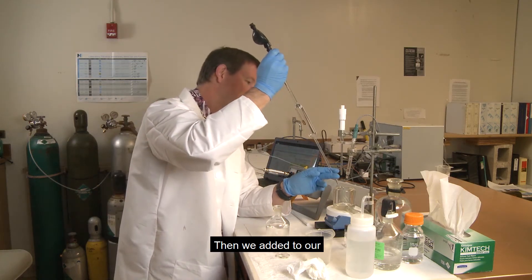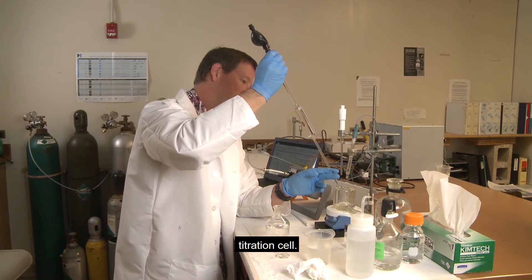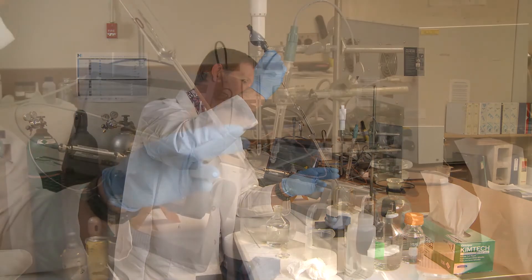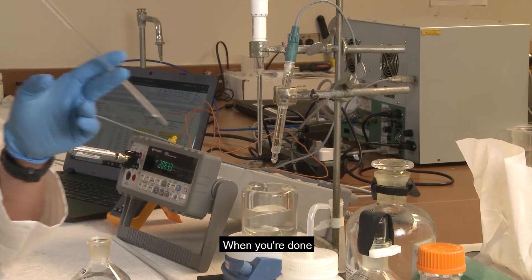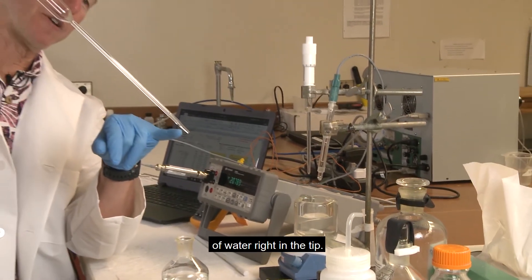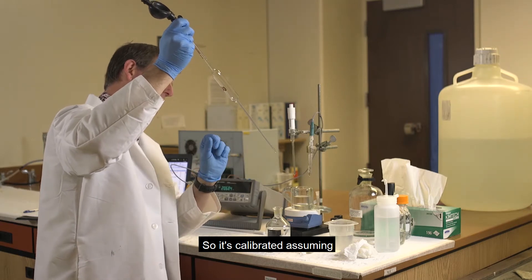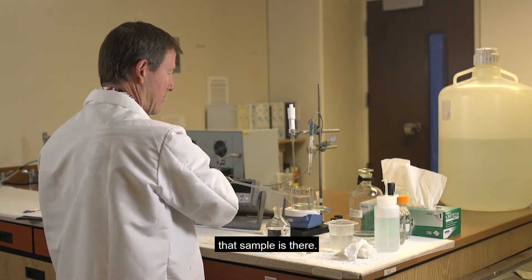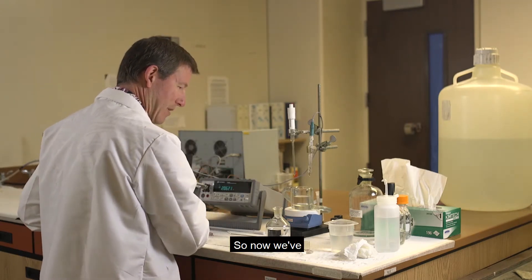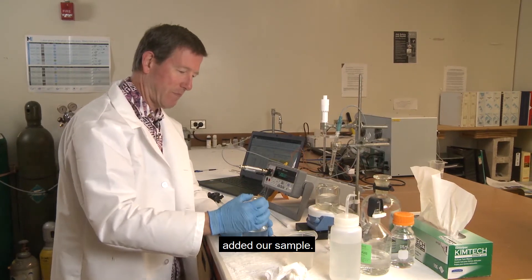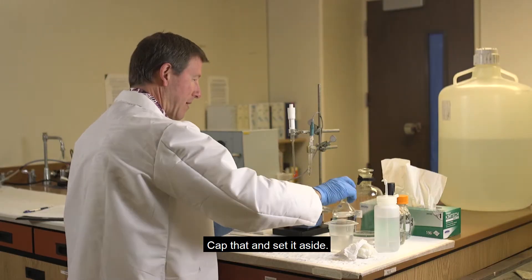Then we add it to our titration cell. When you're done, there's still a little bit of water right in the tip. That's supposed to be there, so it's calibrated assuming that that sample is there. So now we've added our sample, cap that and set it aside.